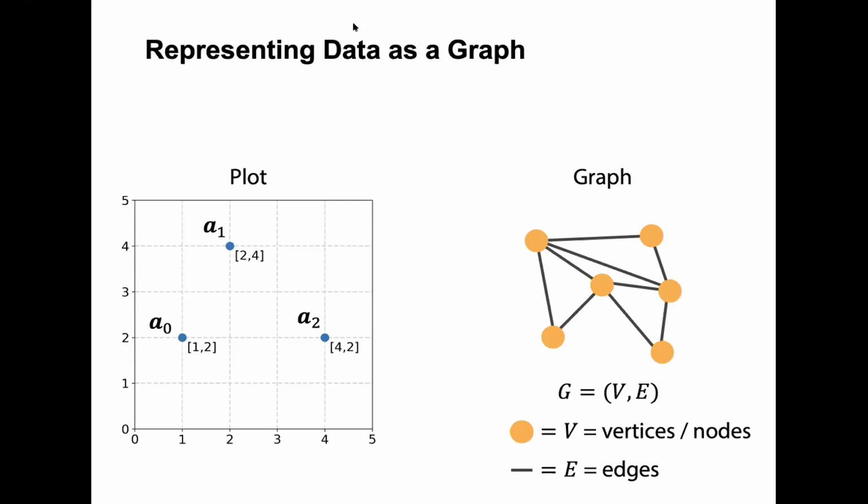So what you can do based on distances is go from a representation of your data that is encoded as observations by features to similarities between points. And this kind of representation is also called a graph. In a graph, each vertex or point represents an observation, and edges are these connections between these points.